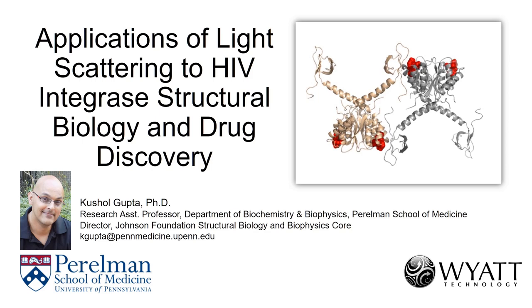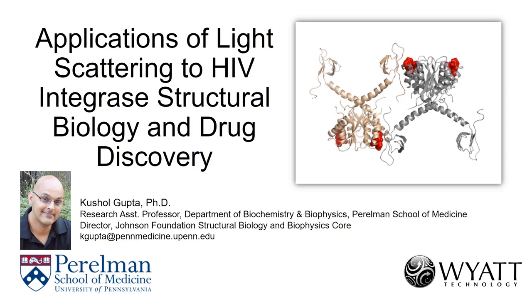Today, I'm going to tell you about how important light scattering has been to my ongoing research of the HIV protein integrase and drug discovery efforts against this target.